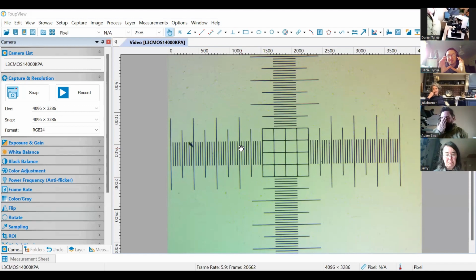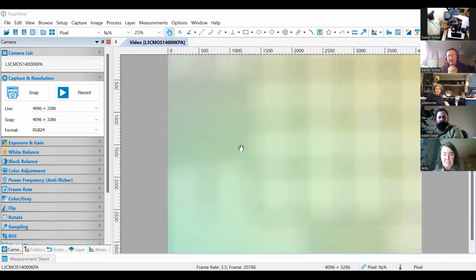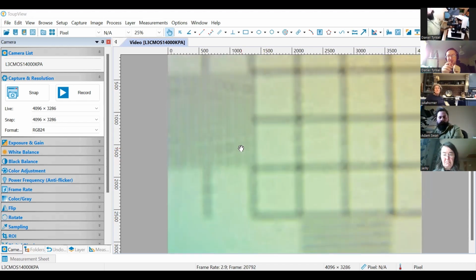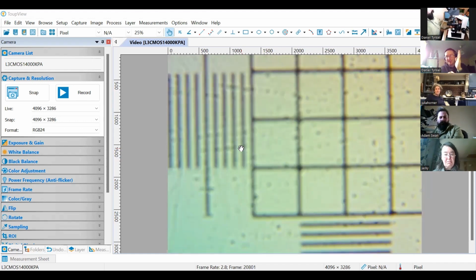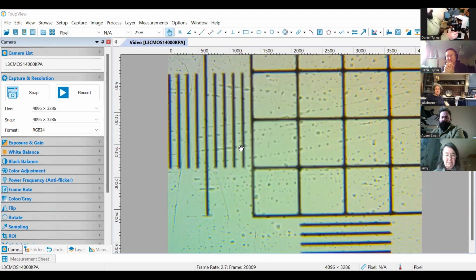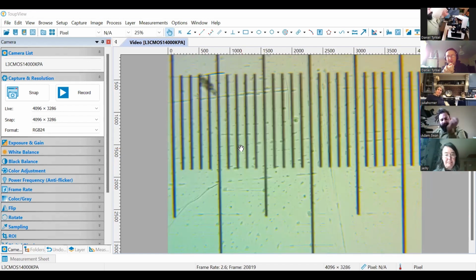And so I believe, Adam, you're at 100 times magnification right now because you can see the entire scale. And that entire scale is 1 millimeter across. The entire thing is 1 millimeter across only. So if you were to drop down now to 400 with this scale, now you can see that the smallest distance between the individual bars, from the left-hand side of one bar to the left-hand side of the other bar, is 10 micron. So it's 1/100th of a millimeter.